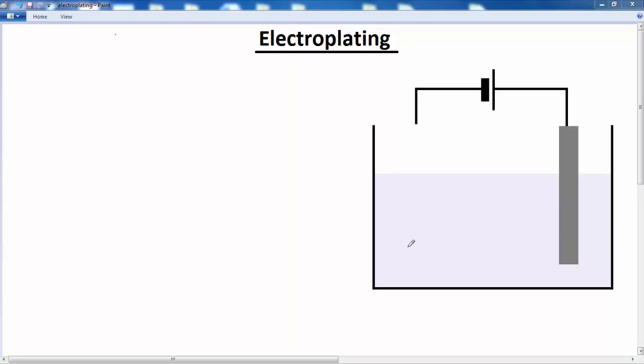Before we start, let's look at the electrolysis bath that we have here. You can see the positive and negative terminals of the battery. So this electrode is attached to the positive terminal of the battery, so this is the anode. And the cathode will be attached to the negative terminal.